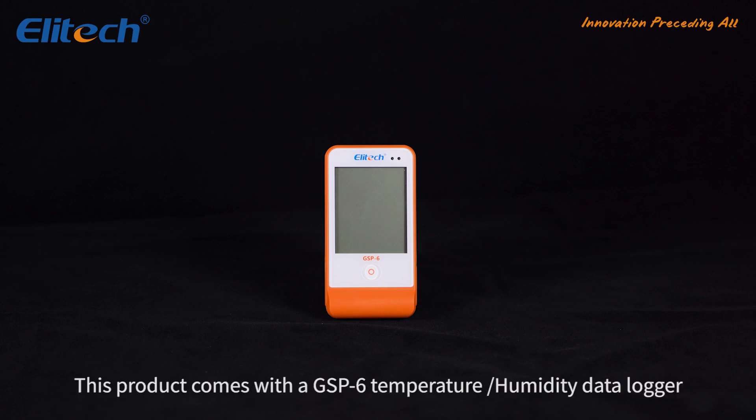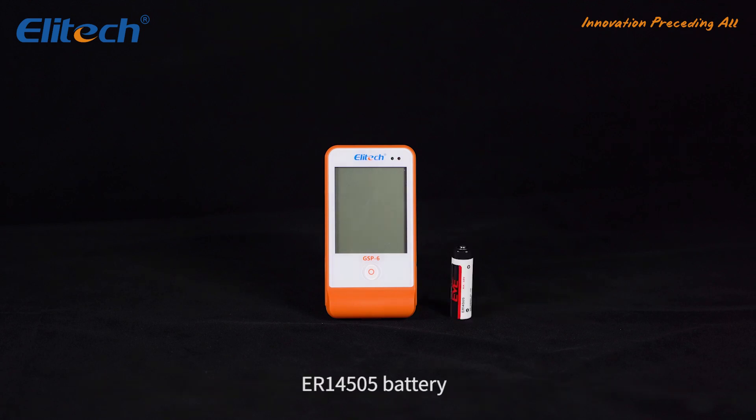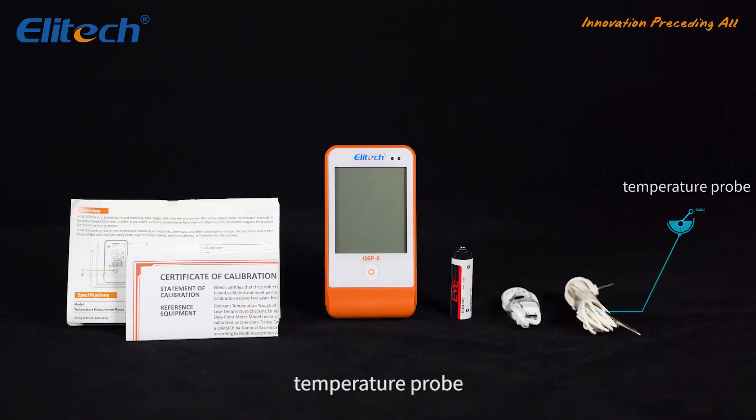This product comes with a GSP-6 temperature/humidity data logger, ER14505 battery, user manual, a calibration certificate, and a USB cable.